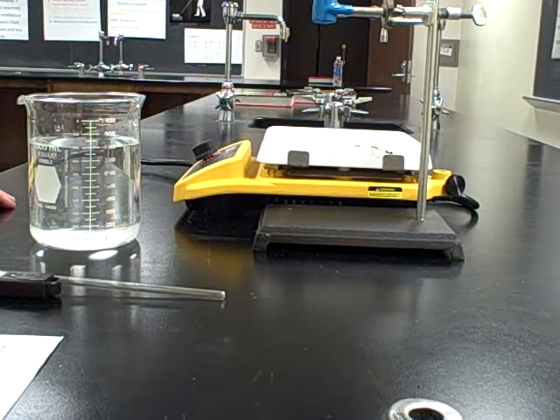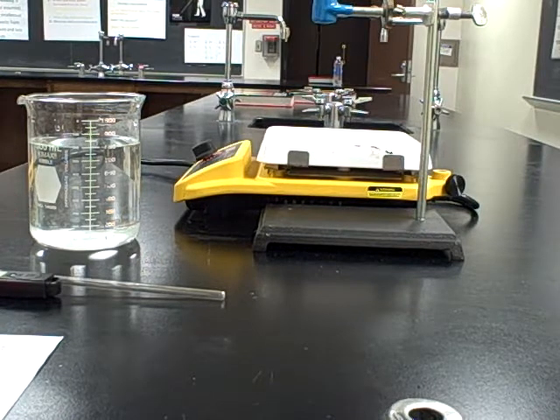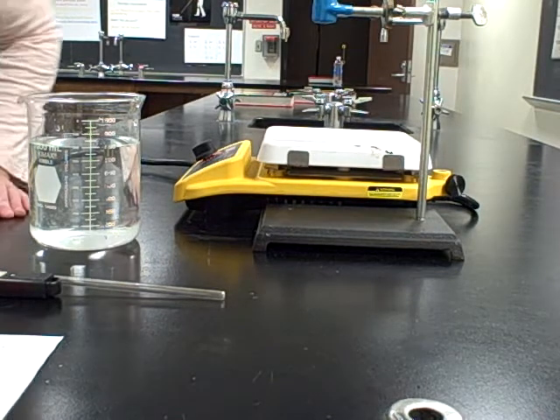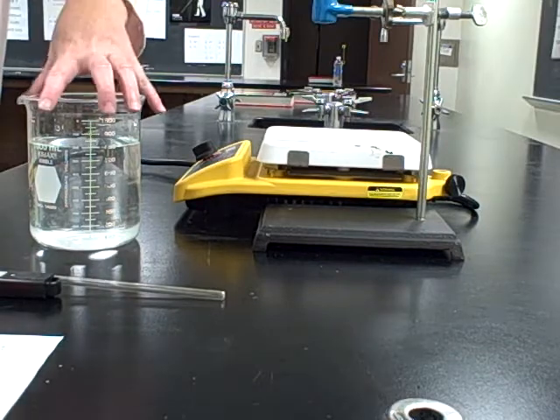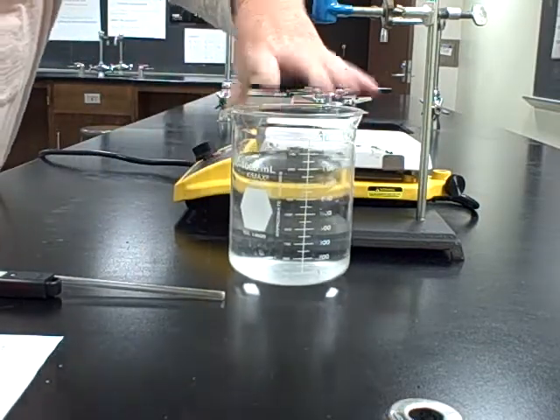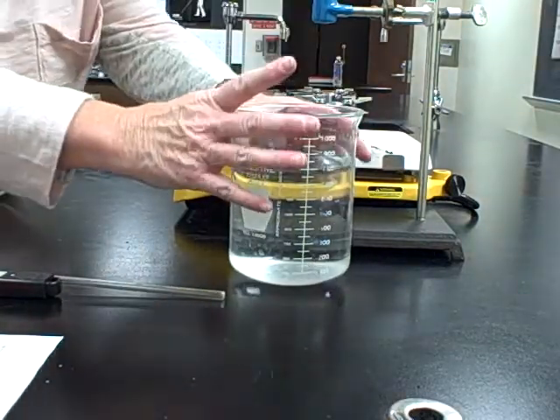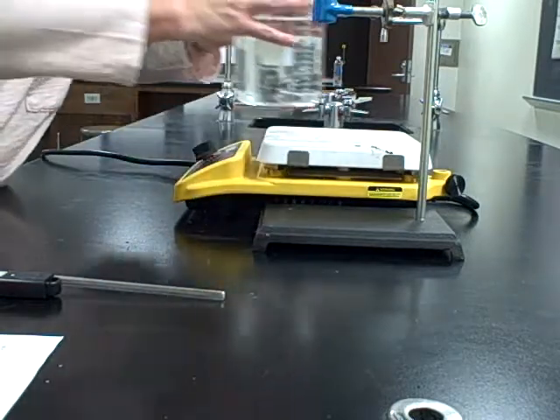The procedure says step one, fill your beaker about two-thirds full of water and make sure you can immerse the flask up to its neck without spilling water over. So here's my big beaker, about a thousand milliliter beaker. I filled it a little over 700, between 700 and 800.